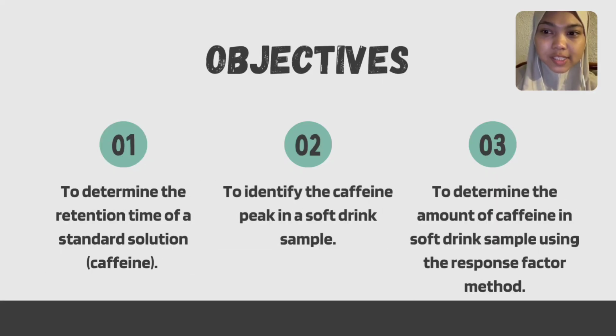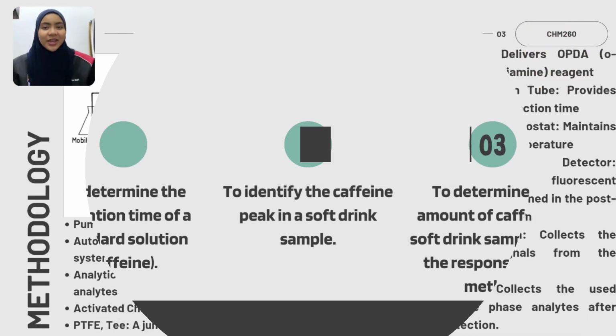Our objectives for this study are, first, to determine the retention time of a standard solution, which is caffeine. Second, to identify the caffeine peak in the soft drink sample. And lastly, to determine the amount of caffeine in the soft drink sample using the response factor method.